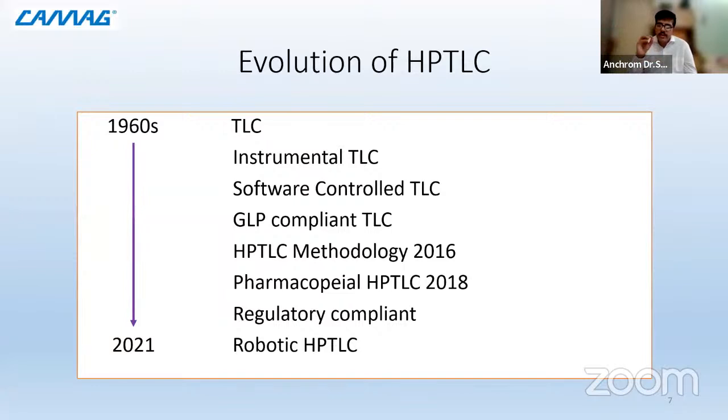So in the evening, you can go setting up things, and in the morning, you can get all the data in your hand. So you just need to review the data, and that's it. So that is the technological advances which have come up and giving you a lot of potential to work into it.